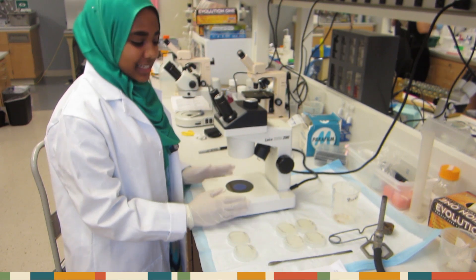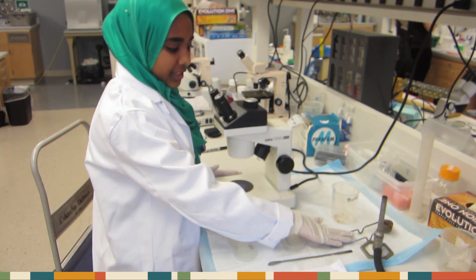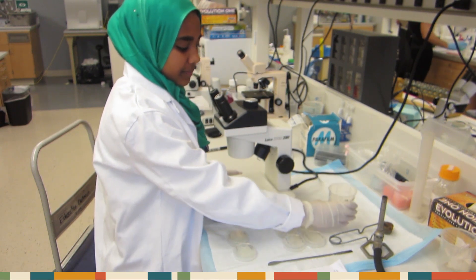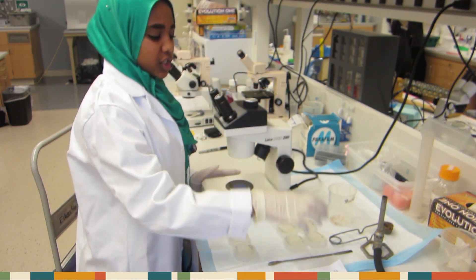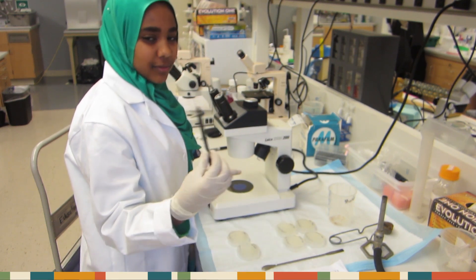Here are all the materials. You have a dissecting scope, Bunsen burner, lighter, disposable waste bin, your worm plates, square-ended spatula, your data table, and your writing utensil.